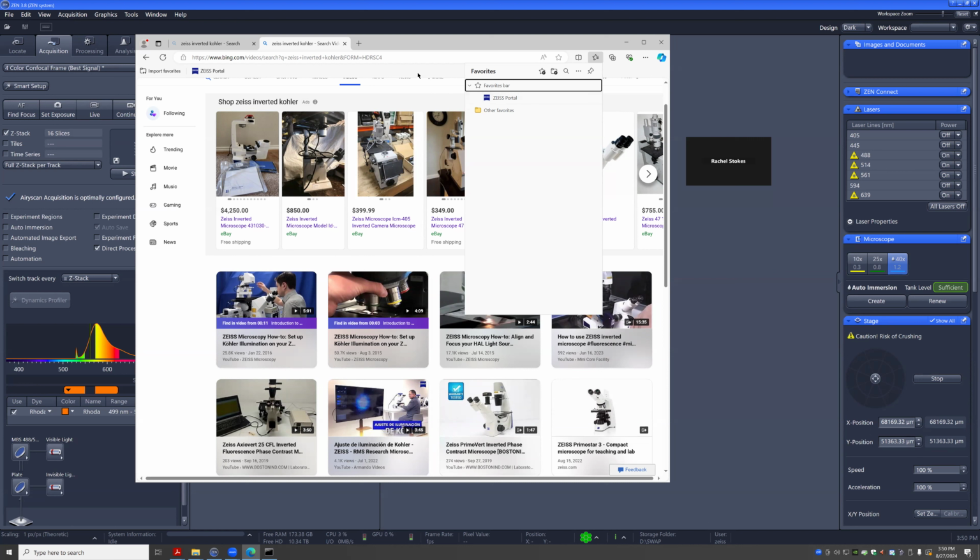Did you actually end up making an account? Good, perfect. I would honestly say everyone just use your account, because it's mostly just for you to have a login to get to the videos. You can do other stuff in there as well, like put in service tickets. One account, or maybe one per lab, should be enough because you can tie it to this microscope too, so that when you put in a service request it's tied to this system, and then we have a record. But most of the time people use it to get access to the tutorial videos. So that'll be right here.